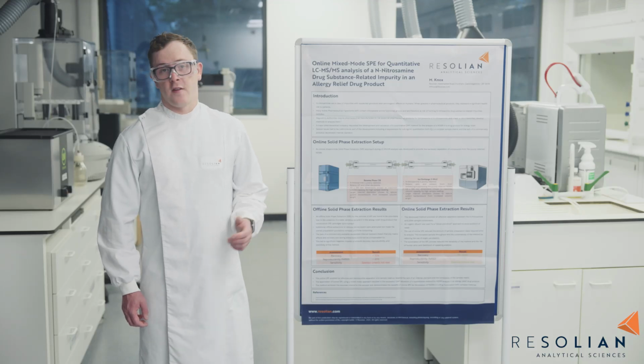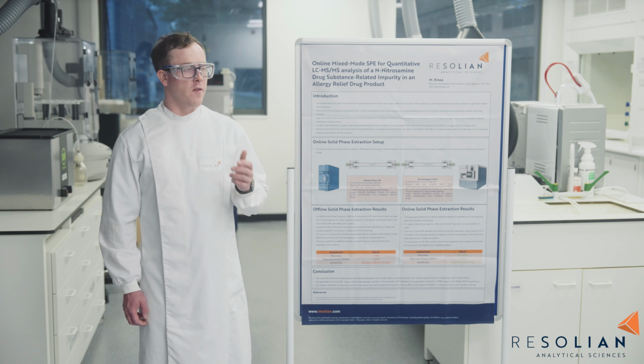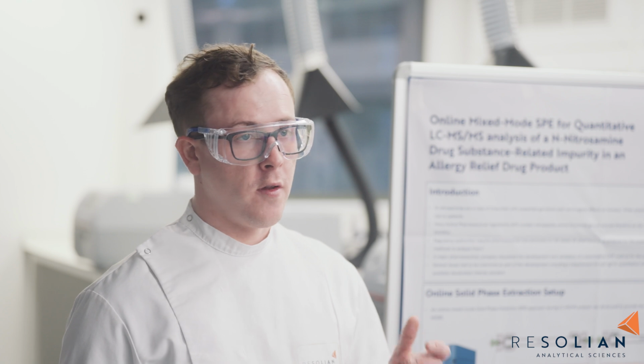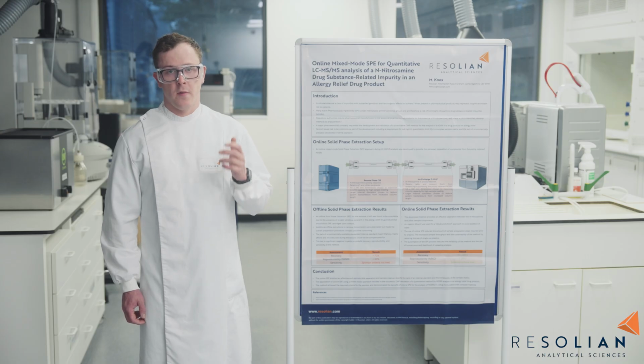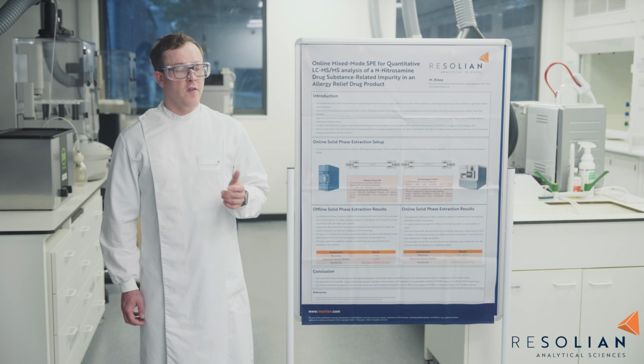Nitrosamines are a class of carcinogenic chemicals typically found as impurities that represent a major health risk to patients due to the ease with which they can form and their mutagenic properties. Many active pharmaceutical ingredients, or APIs, contain nitrosatable amine groups and are therefore at risk of forming nitrosamine drug substance related impurities, or NDSRIs. Regulatory authorities require pharmaceutical manufacturers to risk assess all pharmaceutical products for the presence of N-nitrosamines, and where a risk is identified, develop methods to analyze them.